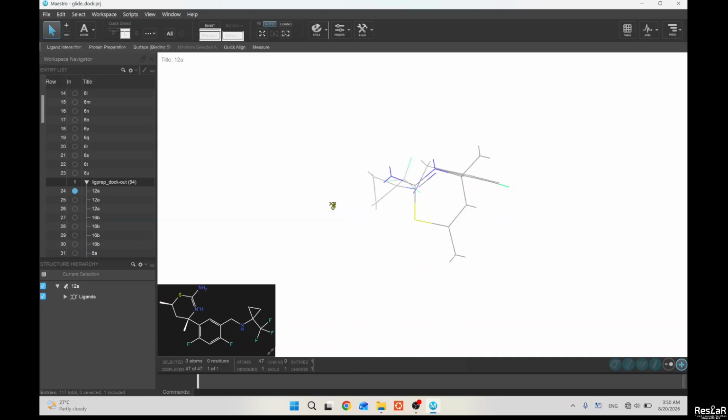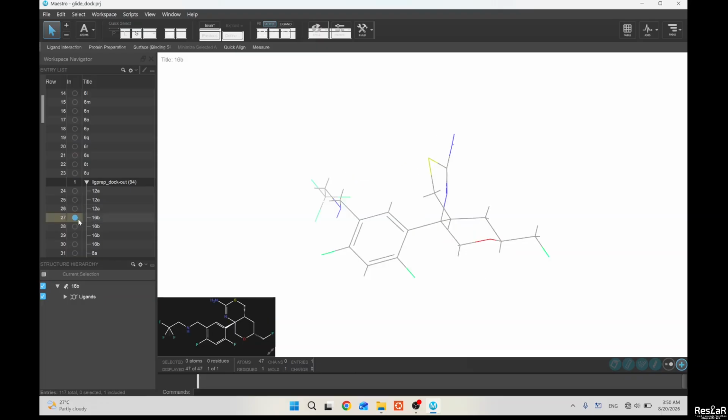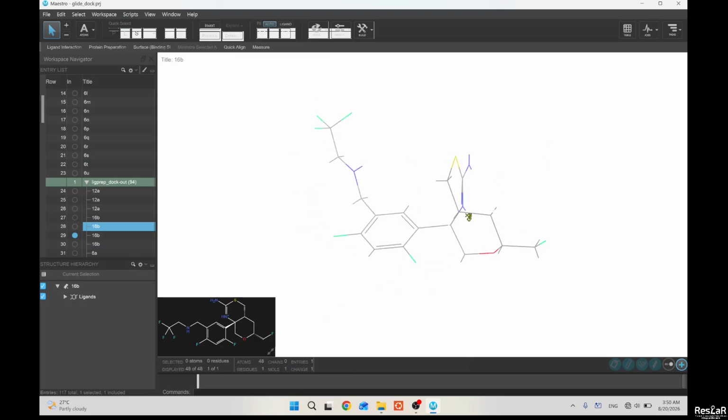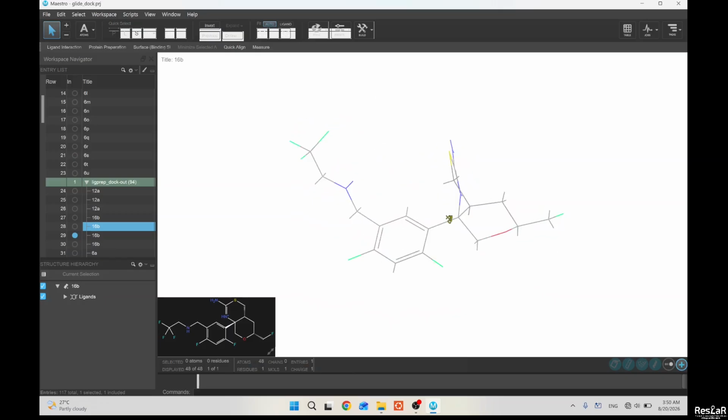You see the ligands are now taking their 3D shape, assuming the necessary configurations that is consistent with their 3D structure, right? So we can see it here. You see this, right? So this is actually what ligand preparation should look like.